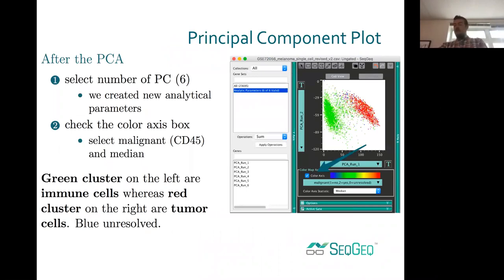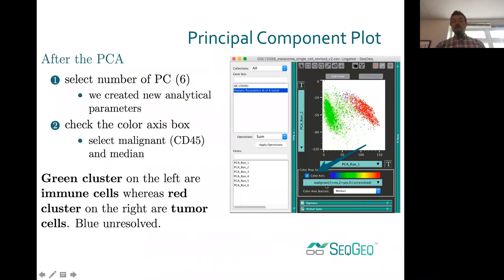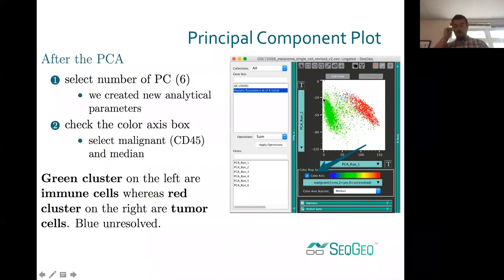After running PCA, SeatGeek displays the first two principal components describing the widest amount of variance. This is the melanoma demo dataset that comes with SeatGeek when you download it. We get nice separation within the first two principal components immediately. If we color map by the categorical malignant parameter — determined by flow cytometry — malignant cells with a value of 2 turn bright red, and non-malignant cells with value 1 turn bright green — those are T cells, B cells, and NK cells.